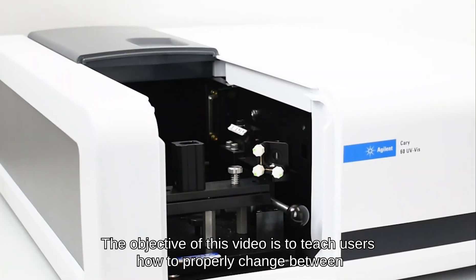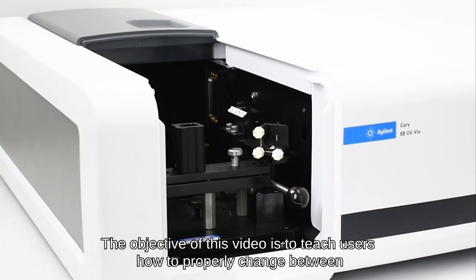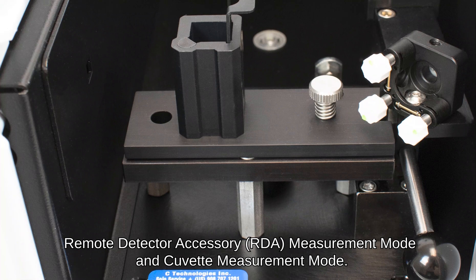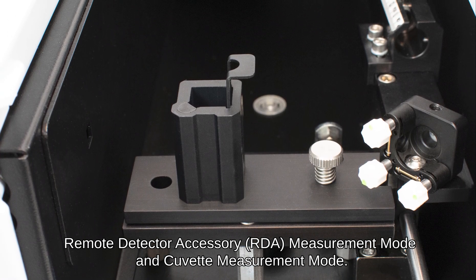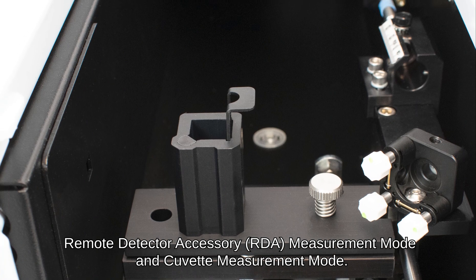The objective of this video is to teach users how to properly change between Remote Detector Accessory measurement mode and cuvette measurement mode.